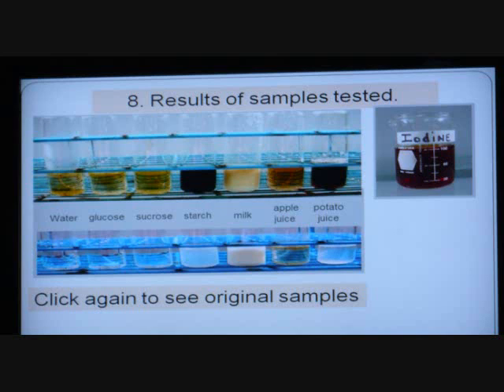It's just the color of iodine. Well, apple juice is already urine color. If you add some more to it, it becomes dark. I would still say that's a negative reaction. But if you go back and look at these, ain't nothing like that.